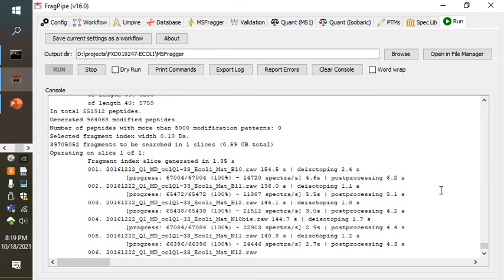If I'm doing my math correctly, 150 seconds is 2.5 minutes. So 2.5 minutes to read the raw file into this fragment index, to rapidly do deisotoping, of course, en route. And then only 3 seconds for matching time. The world has shifted.